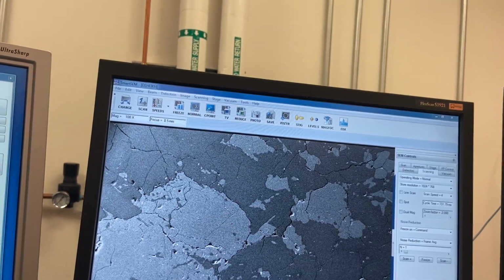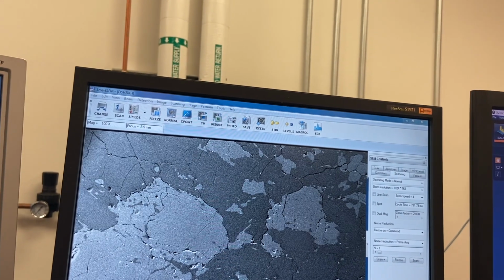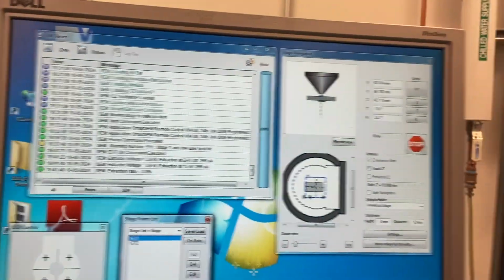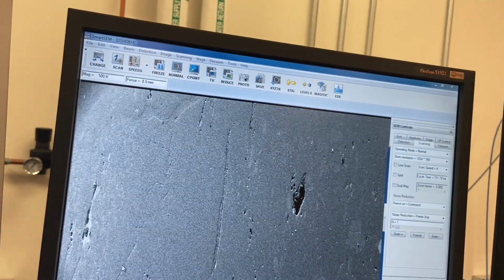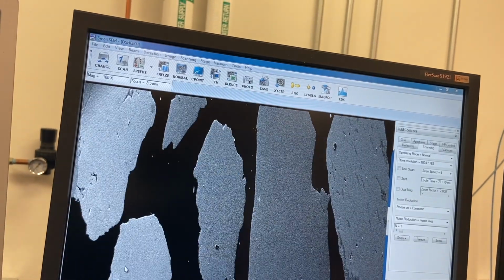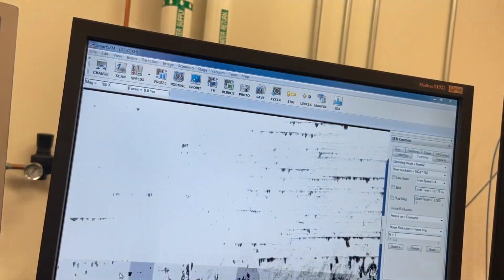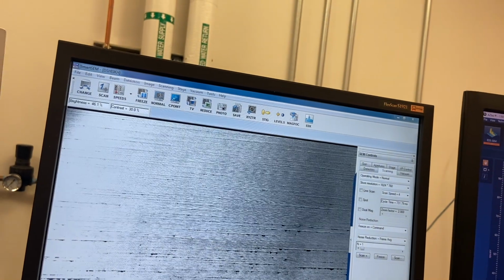All right, so I'm going to call that 1672. All right, so I'm going to go back to the first one. I'm just saving these as points so I can always navigate to them later. And then now I'm going to get to that copper tape that we initially had when we put the sample in. You're going to see it's going to get very bright. Yep, there it is. Lower the contrast. That's a little too much. A little more. There we go.